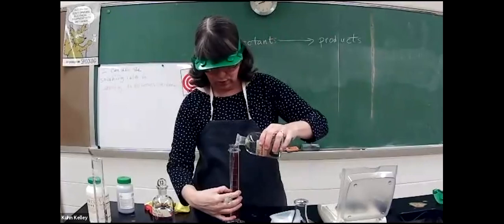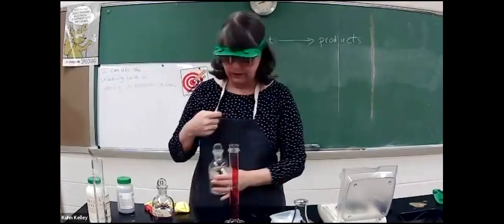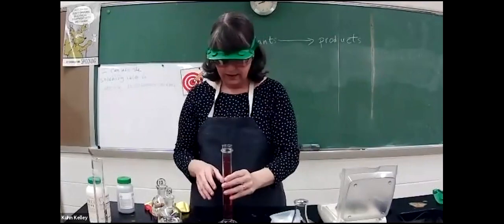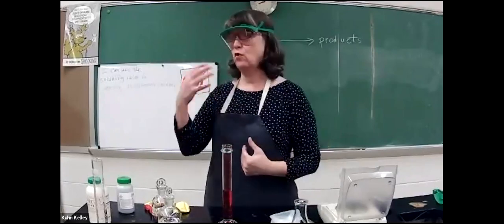Note that as I pour, I am keeping my graduated cylinder on a flat surface. That way, if I accidentally spill, it doesn't splash everywhere. Like if I was holding it up here and I overflowed, it would go everywhere. I've got just a little more than I needed, but this lab is qualitative as opposed to quantitative.